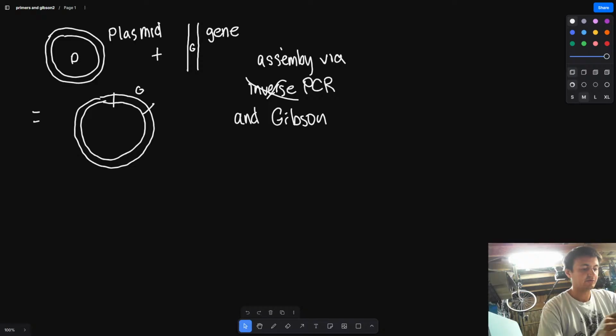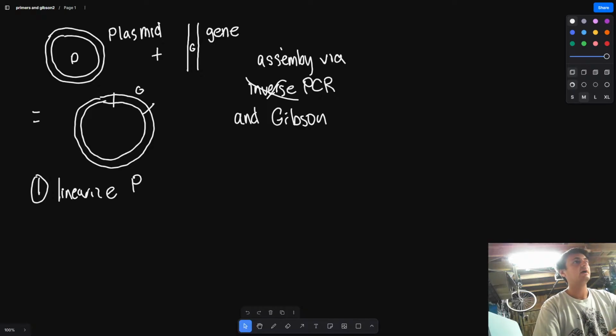Okay, so the first step that we need to do is we are going to need to linearize. So this first step, step 1, linearize P. Now, I will say, I think you probably want to have already watched a video on PCR.